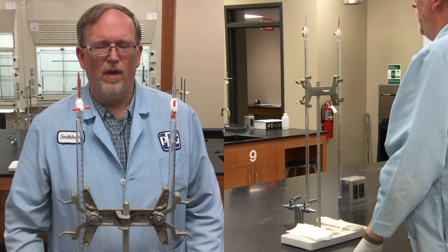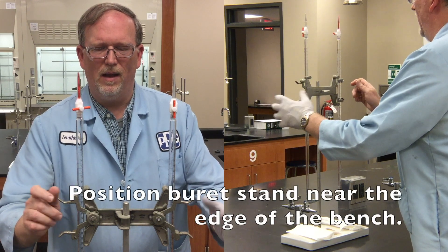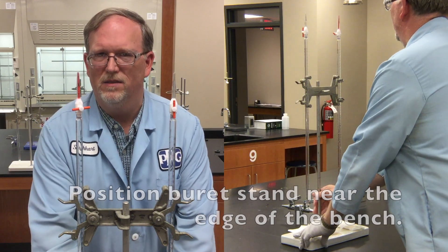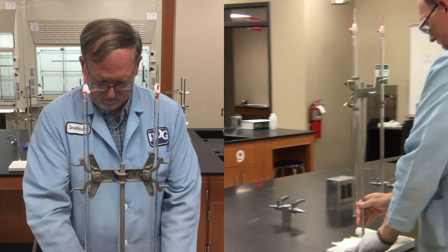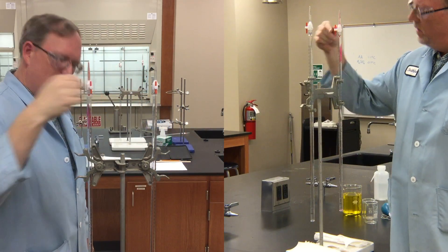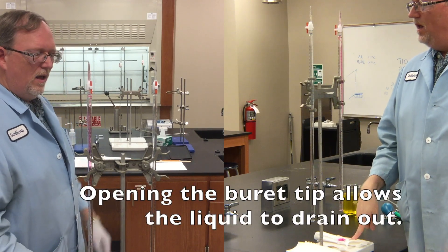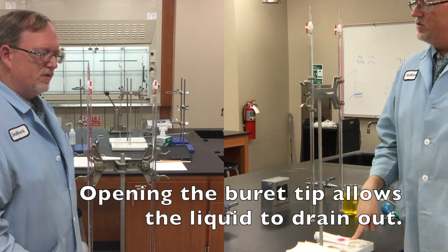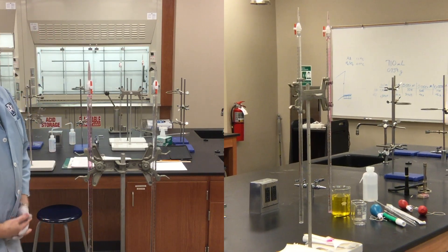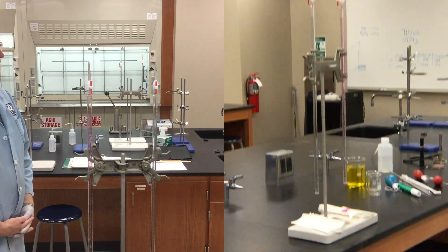If you want to do some burette work, then the very first thing to do is to move the burette stand close to the edge of the bench, where it can be reached easily. Watch what happens as Dr. Smith-Hart opens the tip — the trapped liquid is now released. So you probably want to clean this and the tip before you use it.